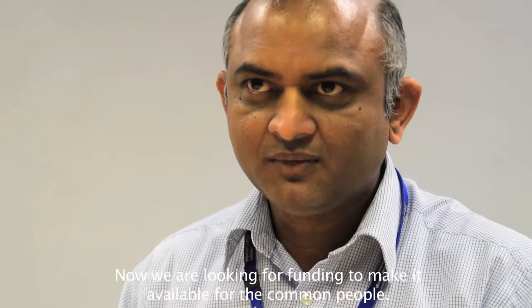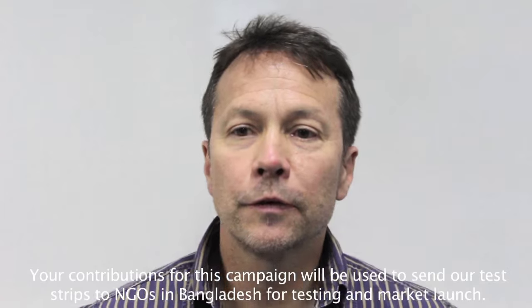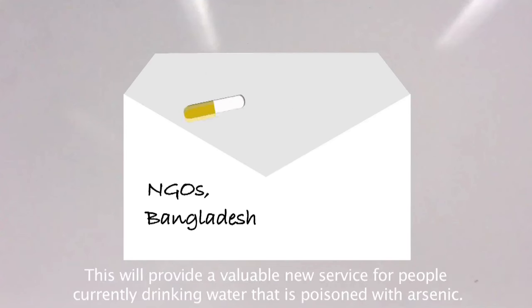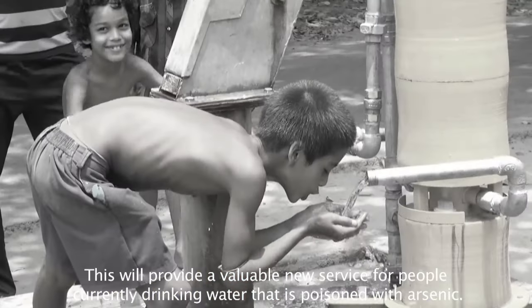Now we are looking for funding to make it available for the common people. Your contributions for this campaign will be used to send our test strips to NGOs in Bangladesh for testing and market launch. This will provide a valuable new service for people currently drinking water that is poisoned with arsenic.